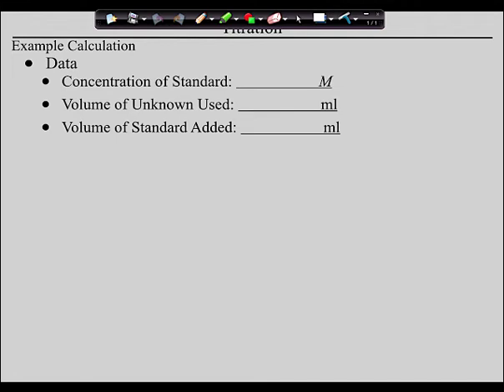Guys, these are what are called burettes. And the thing that makes them so expensive is actually these markings that are on them. Guys, on a graduated cylinder, these markings, especially if they're glass, are just painted onto the cylinder. And they're close, but they're not perfect. Guys, on a burette, these are actually laser etched into the glass, and they're very, very accurate. That's what makes them expensive.